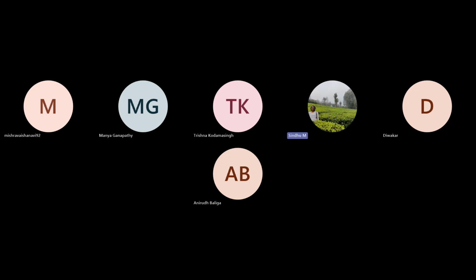So far, whatever we have been seeing here are single channel images, just black and white, but you can also have multi-channel images like what we get from epifluorescence microscope imaging, typically done after immunostaining or immunohistochemistry and so on.